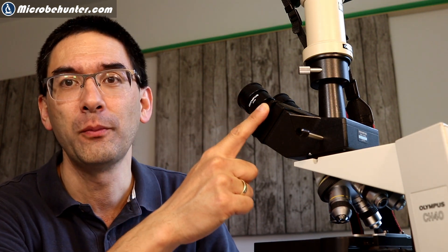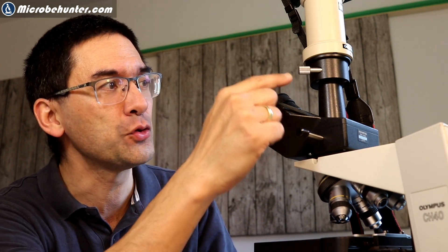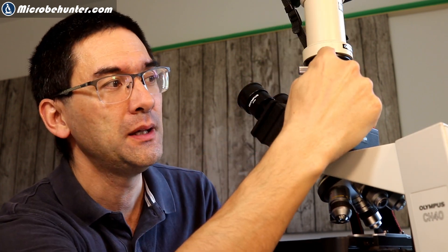So hi, MicrobeHunter here. Oliver is here. And today I received a question about trinocular heads for microscopes. These are the microscope heads that have a fold tube so that you can connect the camera. And the question is now as follows.